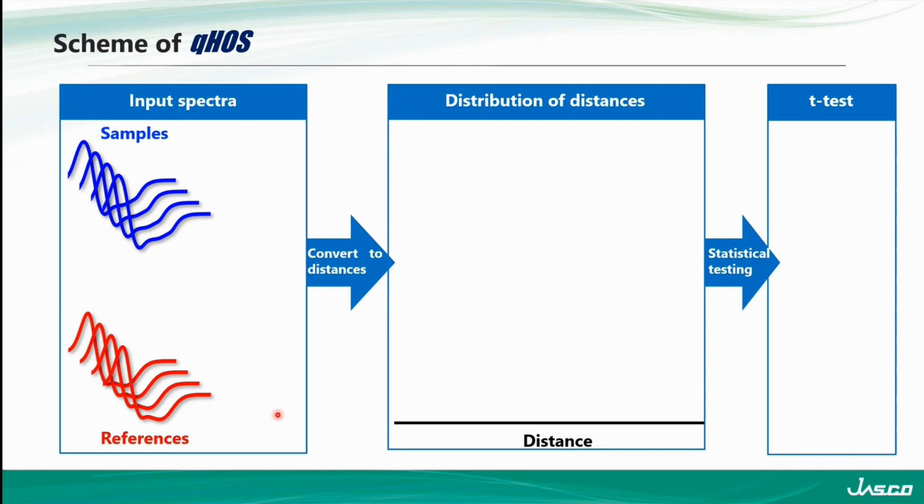In this case, what we're going to do with these references, they could be a variety of things. This could be innovator materials, like I previously mentioned. In particular with MABs, you have innovator materials that go after a specific target, and then maybe someone comes along, finds a better way or a simpler way to produce that material. And that'll be our biosimilar that we'll want to match with whatever the innovator is, because that'll be confirmation that the structures are the same.